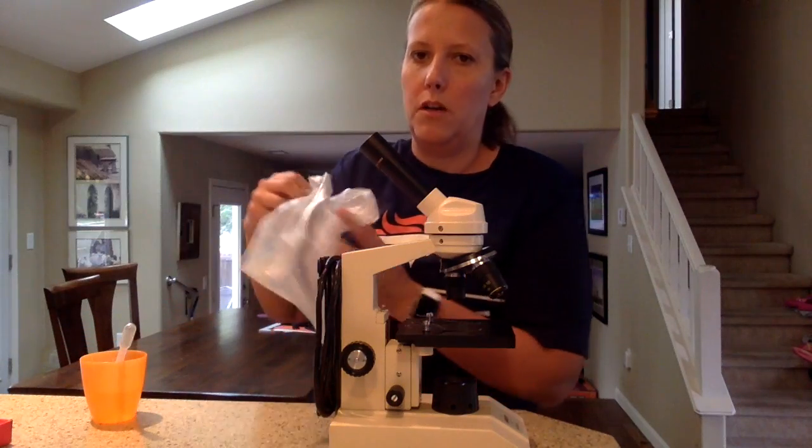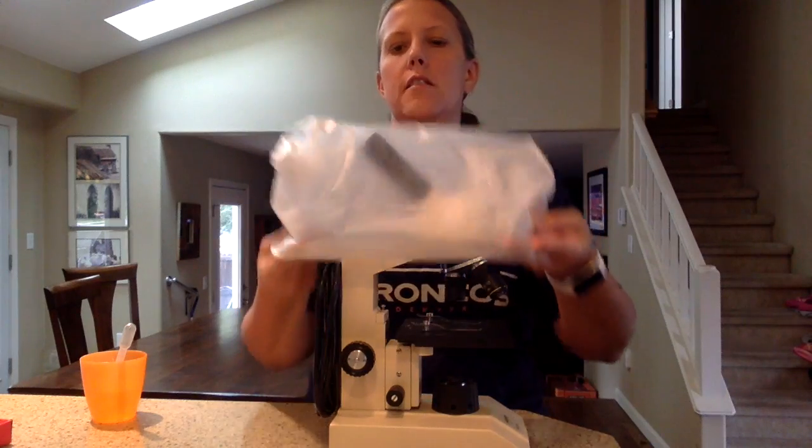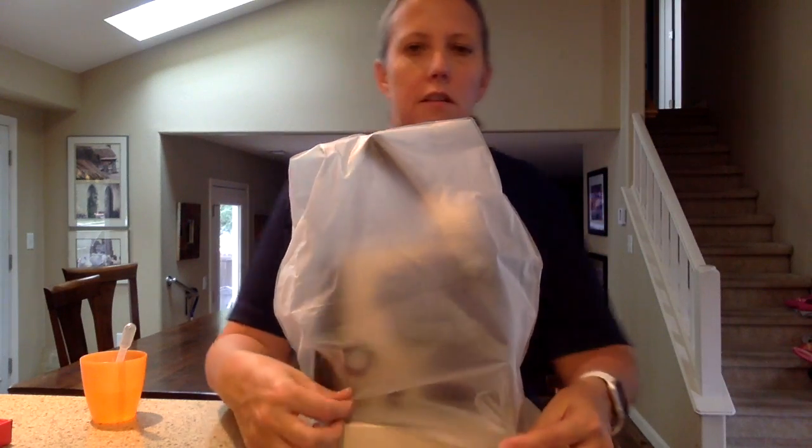And that's how to use a microscope. Make sure when you're done: stage down, low power down, light off, and cover on.